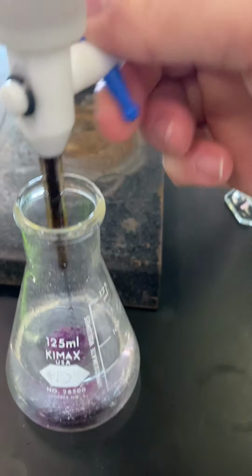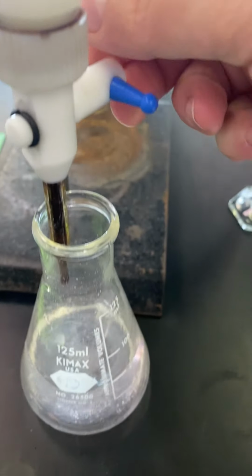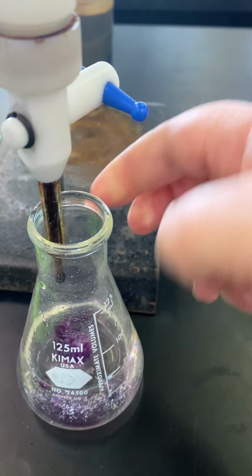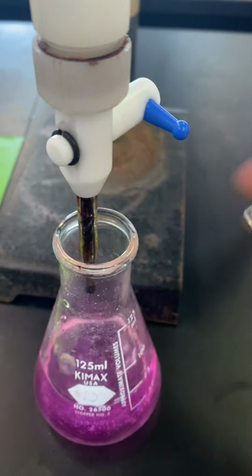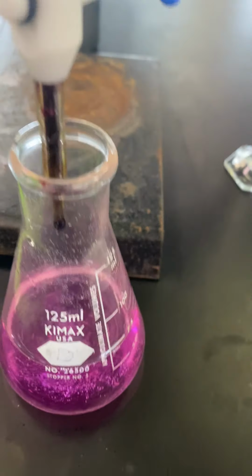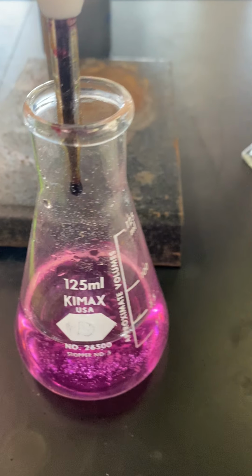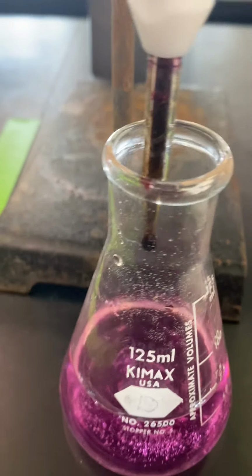If you can tell, that purple color is hanging out longer. See how long that purple color stuck around that time? I'm going to try a single drop. All right, there we go. I took it well past the endpoint, and it just took a couple of drops to take it past. I expected to go past the endpoint because it's my first time, and I'm okay with it.